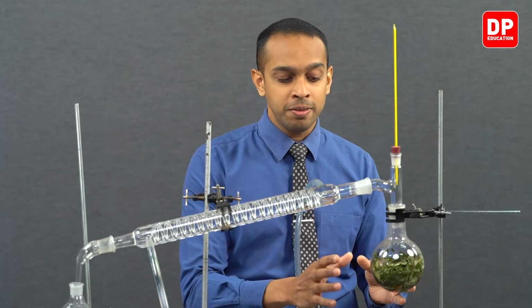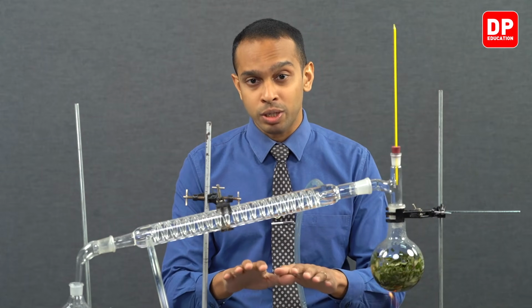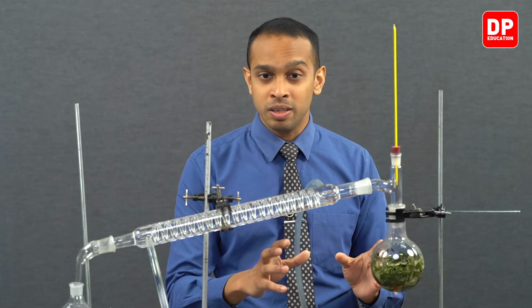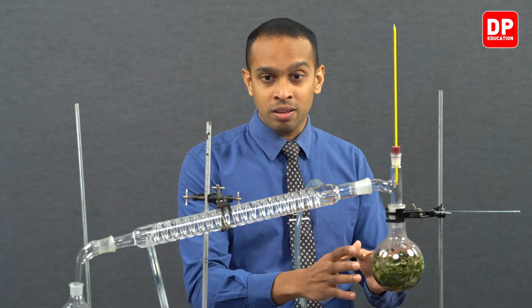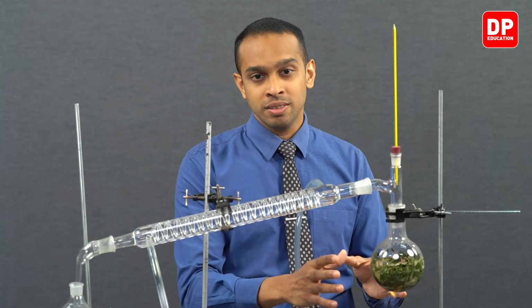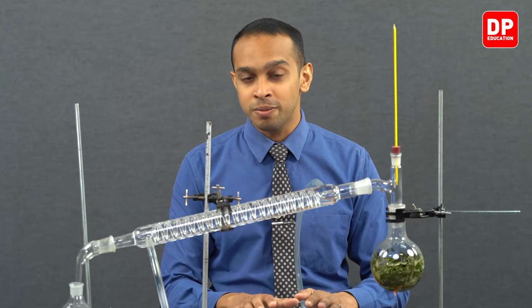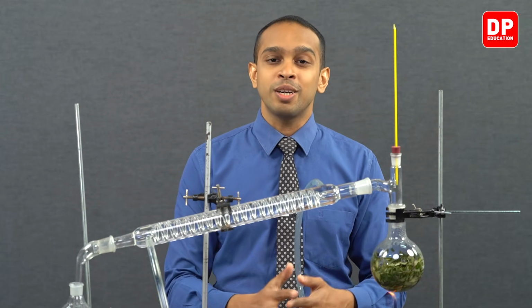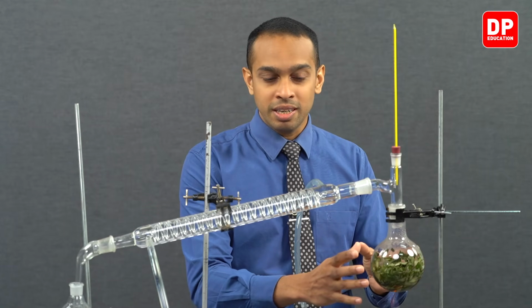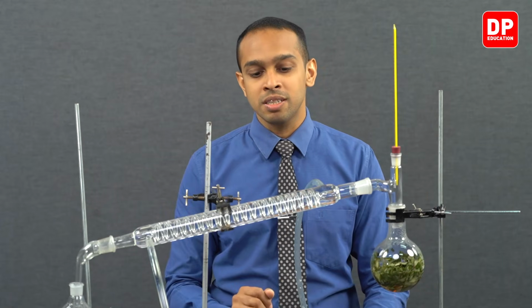So when we have a mixture like this boiling here, and when we have brought down the boiling point of the mixture below 100 degrees Celsius, we can ensure that the essential oil is boiling at a lower temperature, which means the condition at which it boils is now a milder condition, meaning it will not undergo decomposition. So when this mixture is heated, the vapor mixture that is produced will be entering this condenser.